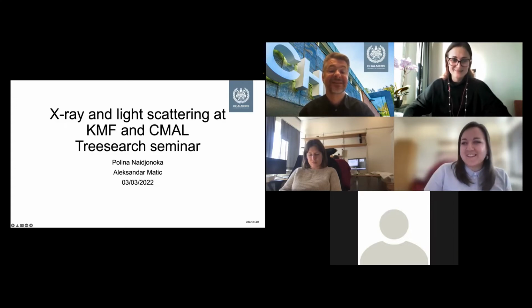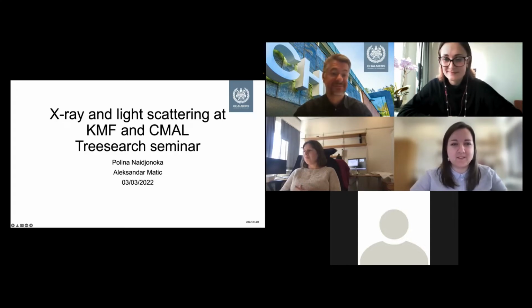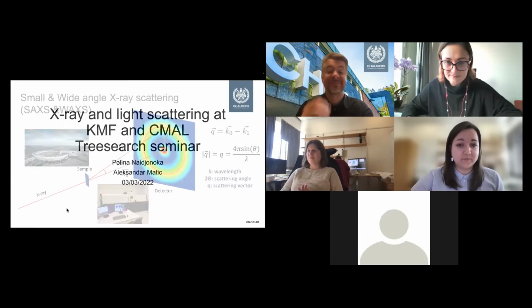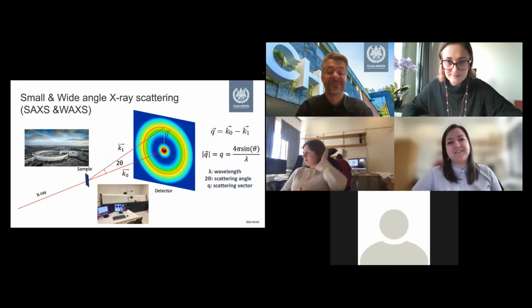Okay, thank you. So hello, everyone. I'm Polina. And today I will tell you a little bit about both X-ray and light scattering that we can do here at Chalmers. So I will start with a little bit of background in X-ray scattering. So maybe a lot of you know what X-ray scattering is, but I will go slightly, a little bit, into the theory.